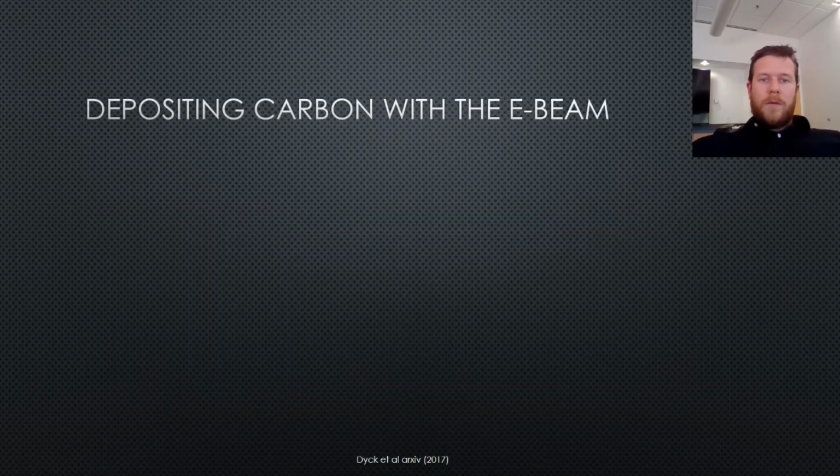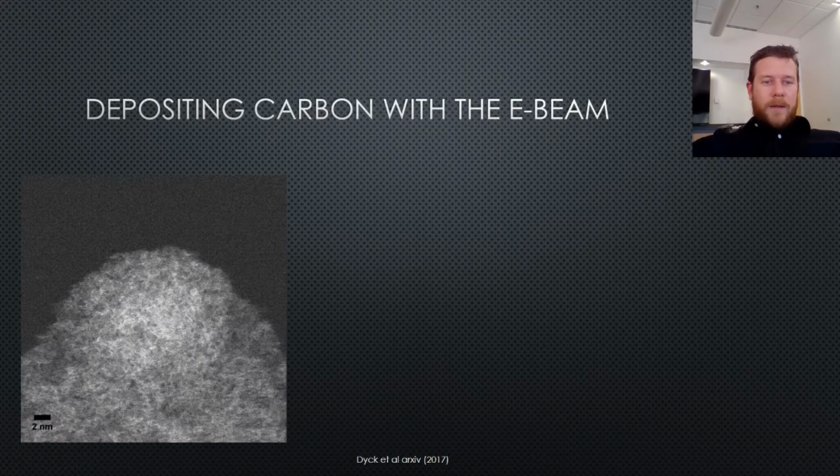Okay, so after cooling that thing back down, I was not able to get atomic resolution images because we get hydrocarbon deposition, and this is probably sourced from other areas of the chip. Only a very small piece of the chip around the sample is heated, and the rest of the chip remains at room temperature. So very likely what we're seeing is migration of carbon from other areas coming into the area of interest and depositing under the E-beam.